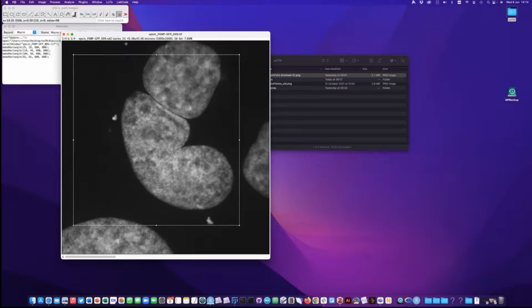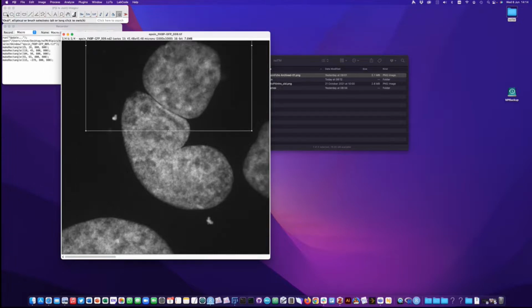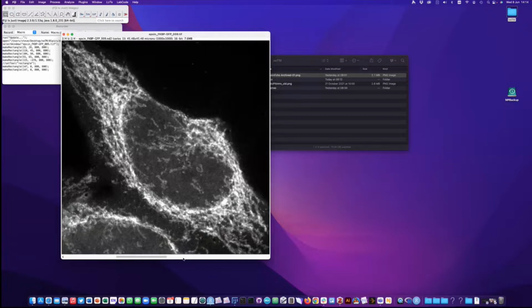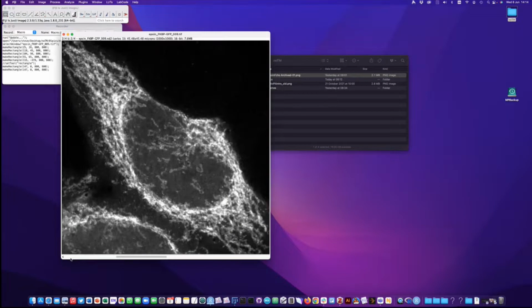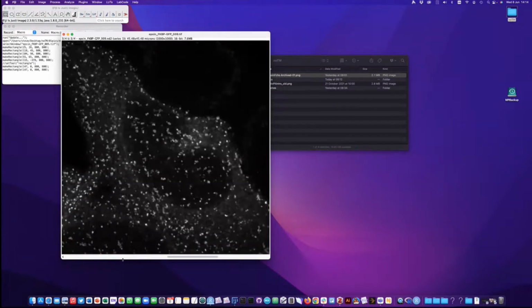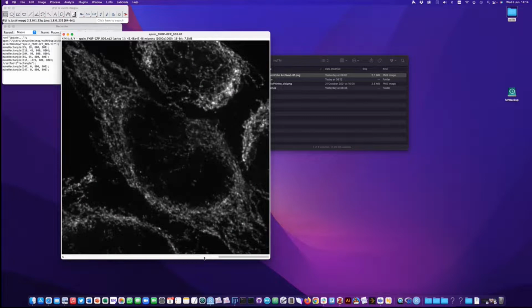Okay, the other thing to say is that there's a scaling on this image which came from the microscope originally. This is 45.48 microns in this direction and the same in the other direction, and because the image is 1,000 pixels, we can calculate the pixel size, and that's important, as I'll explain in a moment. Right, so we've got our images, and you can see we've got 4 channels here. They're in wavelength order: DNA, a green channel, a red channel, and then a far red channel.